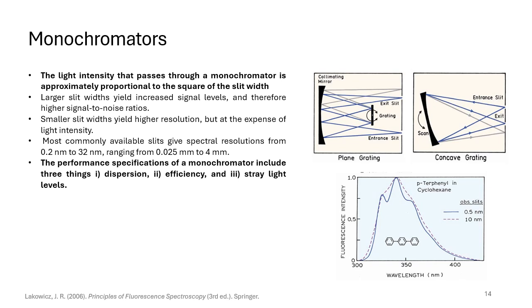Monochromators are used to disperse polychromatic or white light into various colors or wavelengths. This dispersion can be achieved using a prism or diffraction gratings. The performance of a monochromator depends upon the dispersion and how efficiently it can block the stray lights.